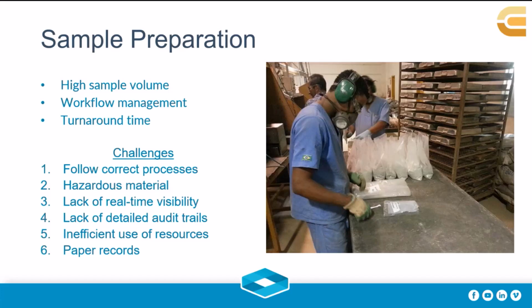Now, obviously, turnaround time for the sample preparation process is important, because any delays, bottlenecks or backlogs cause a delay in the sample analysis. Sometimes sample preparation staff don't know the correct procedures for each type of sample.